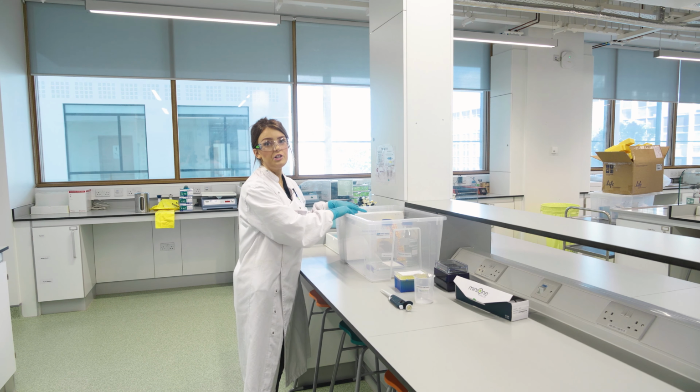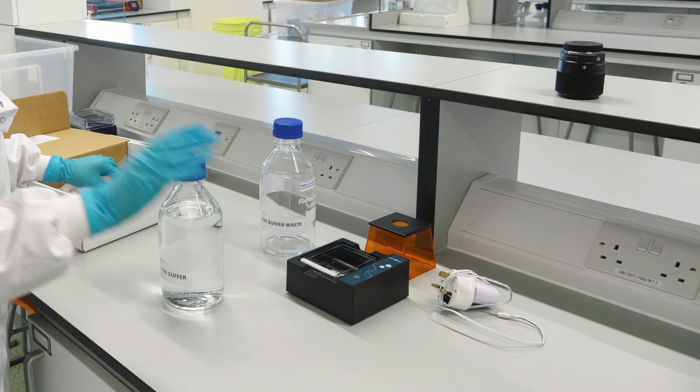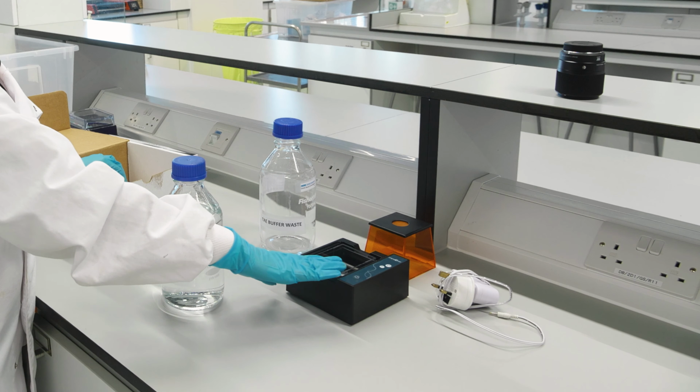Now, 2 groups of students can use the same gel, so you should set up 3 or 4 workstations for 6 or 8 students. So per 6 students, you should give them their Mini 1 apparatus. So for each set of 6, you should give them the Mini 1 tank, the lid that goes on it, and the adapter. You'll also give them their TAE buffer and their buffer waste. When you're finished with the TAE buffer in the Mini 1, put the funnel in the waste beaker and use it then at the end.